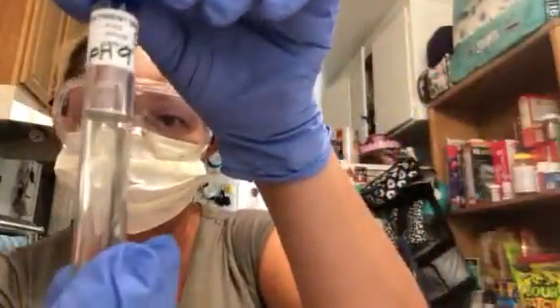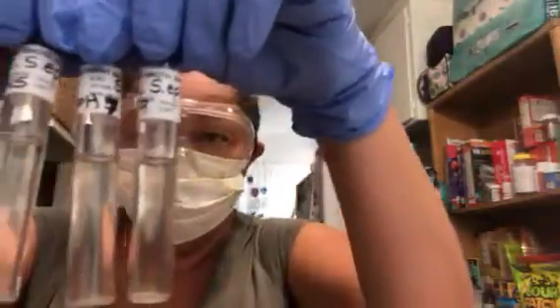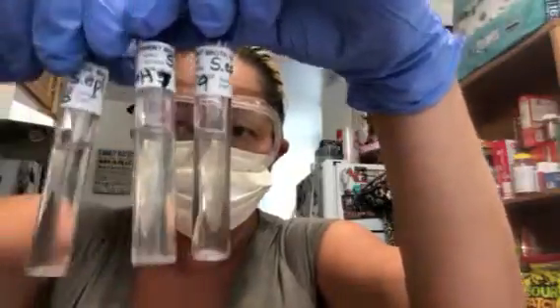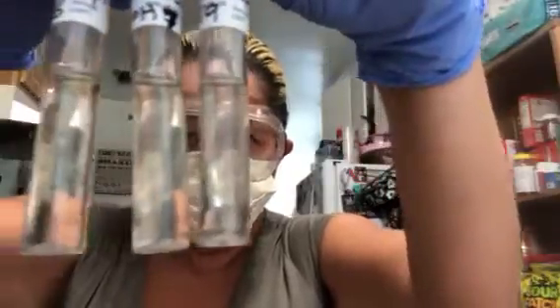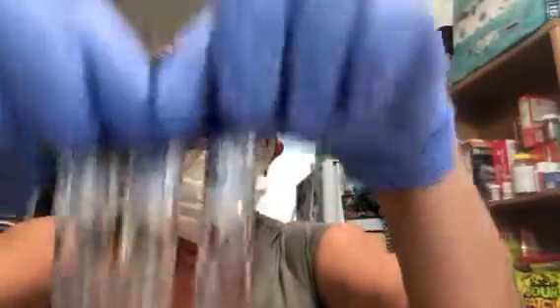Okay, and then S. epidermidis, again, this is pH 9. So if you look at all of them together, this is 5 on the end here, 5, 7, and 9. Very slightly, the 5 seems to be the most clear. So that's very little turbidity in comparison to the S. cerevisiae. This seems way more turbid. Okay, so those are the results for those. Thank you.